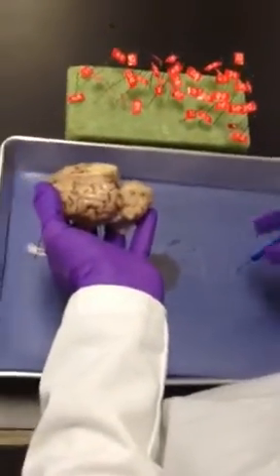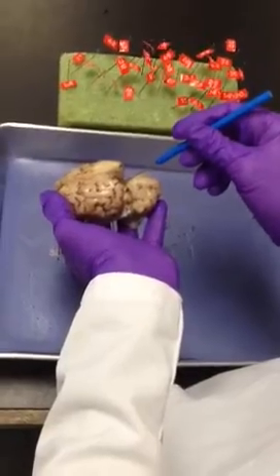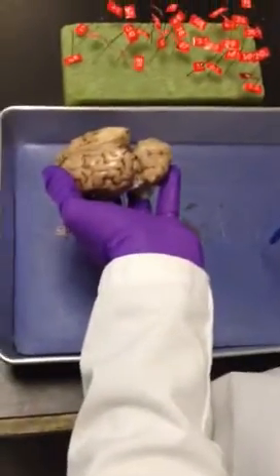With a sheep, they're not the same size. Superior colliculus, huge. Inferior colliculus is kind of small. And on the sheep, it's not so much like a mound, it's more like a little miniature finger or something.